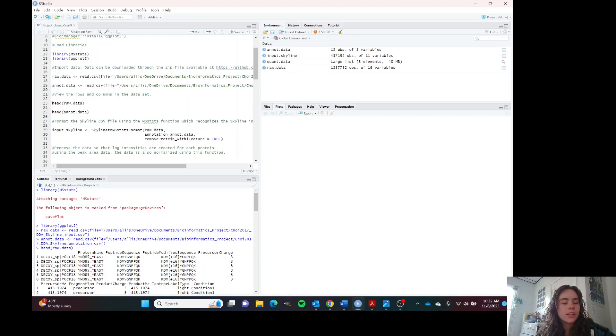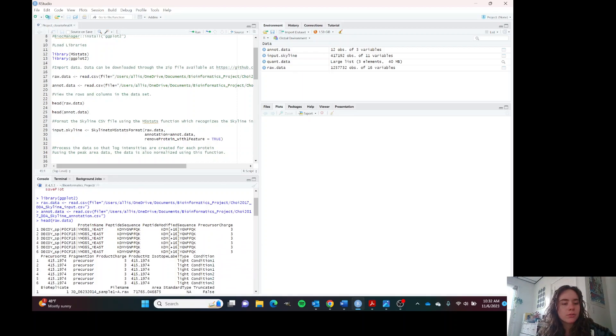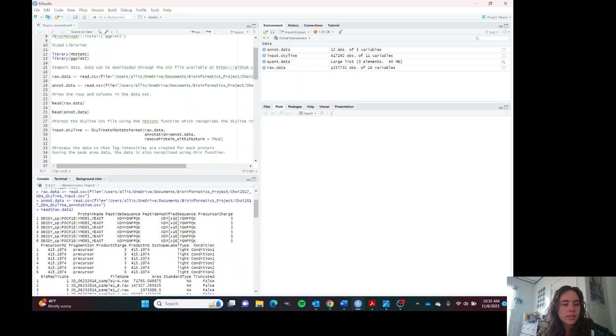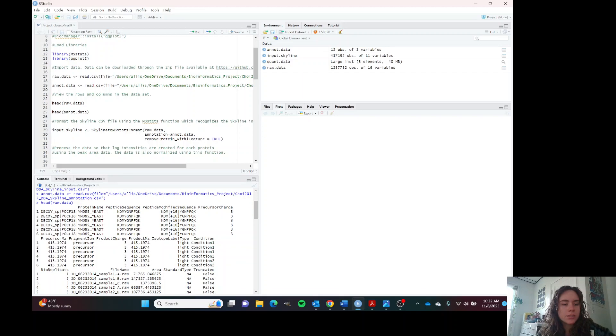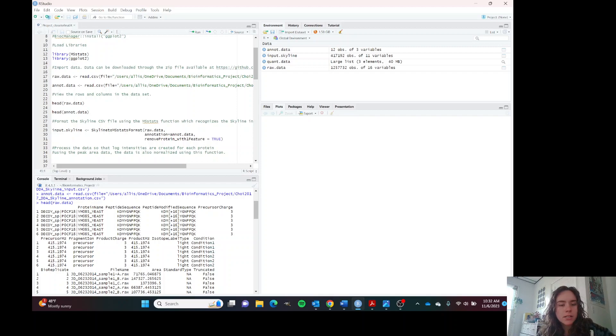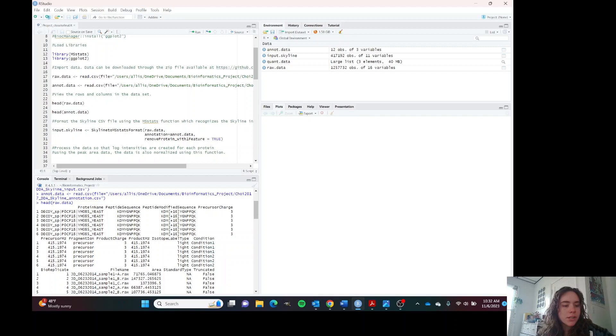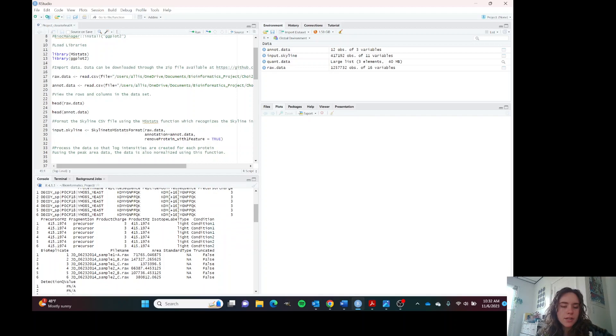We can view what the raw data looks like. We see that there's the protein name, the peptide sequence. This modification may be part of the experiment. We have the precursor charge, the m over z value, and there's no isotope labeling. The condition.